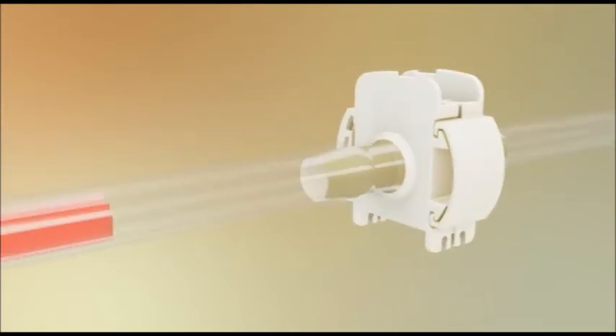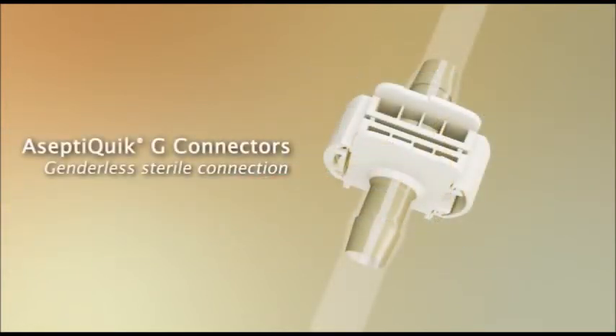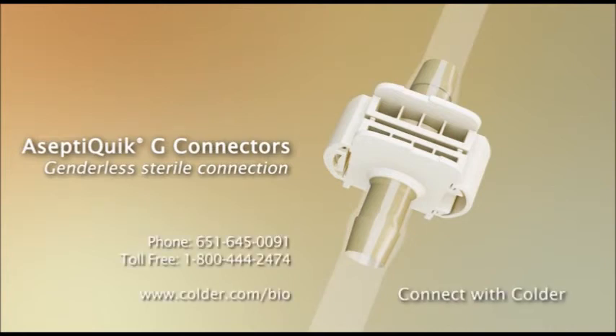You are now ready for sterile fluid transfer. The AceptiQuik G's easy to use genderless design simplifies system integration and minimizes the risk of operator error. Its robust connection provides enhanced user confidence. For applications where reliability and sterility are a must, connect with Kolder. Please contact your Kolder Products representative for additional information on the benefits of the Genderless AceptiQuik G sterile connector.